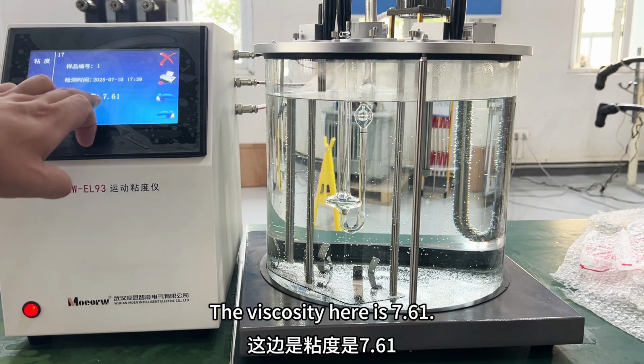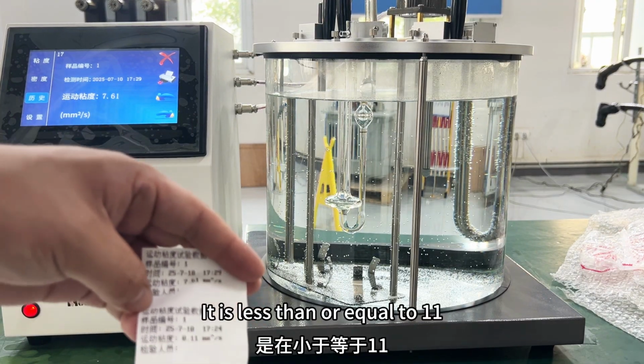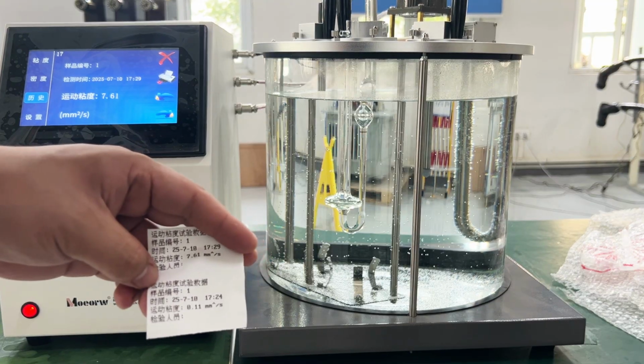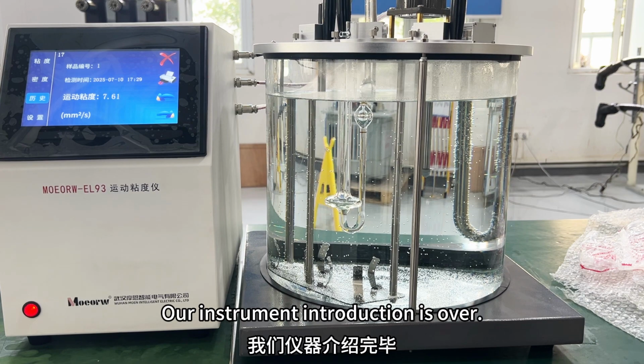The viscosity here is 7.61. Our normal 45 number oil is less than or equal to 11. Our instrument introduction is over.